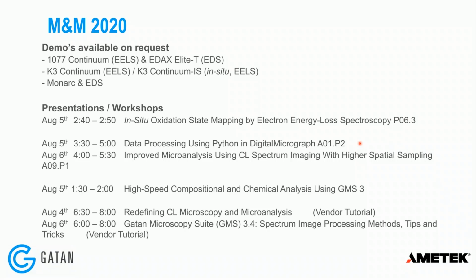So a two camera system is optimal if you want to do both low kV and high kV work. You would do your high energy work on the direct detector and the low energy on the indirect detector. Okay, great. I guess the indirect detectors at low kV really don't suffer from point spread like they do at the high kVs. Yeah, correct.